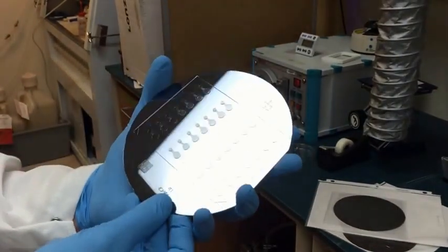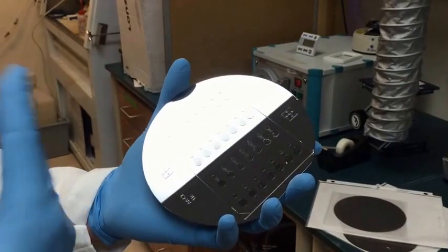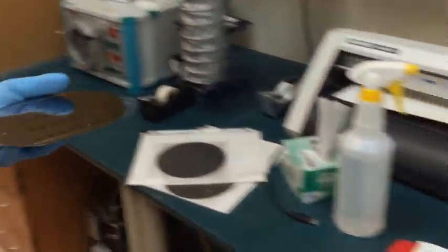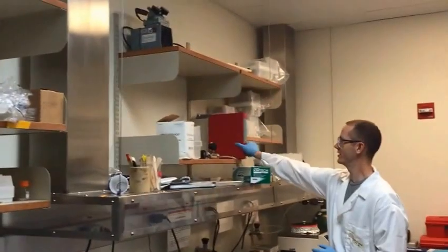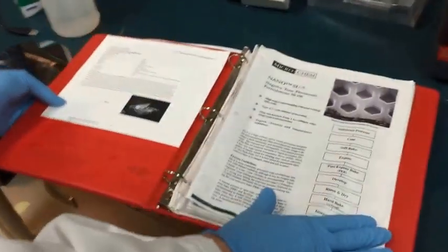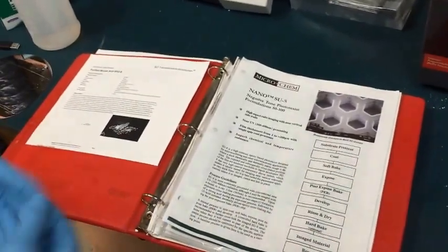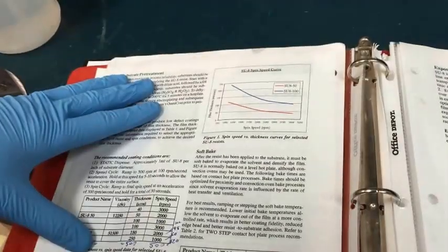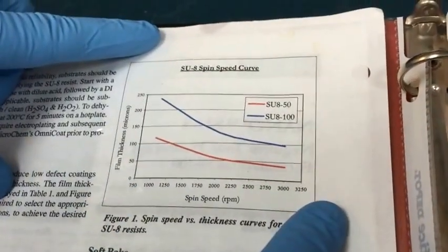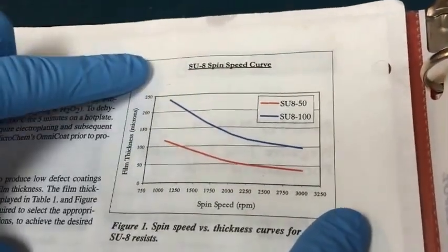The first step is deciding the thicknesses of your layers. For that, we go to our SU-8 protocol that's usually sitting up here. Depending on what thickness of layer you want, you'll choose a different SU-8 epoxy. The part of the document that describes how to create the thickness you want is this graph right here — the x-axis is spin speed and the y-axis is film thickness.